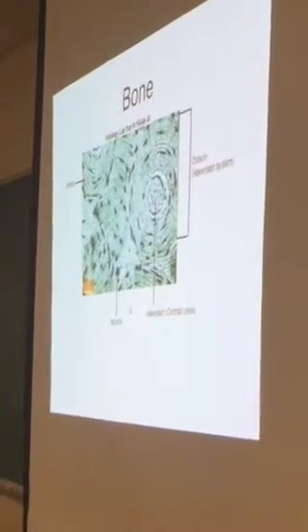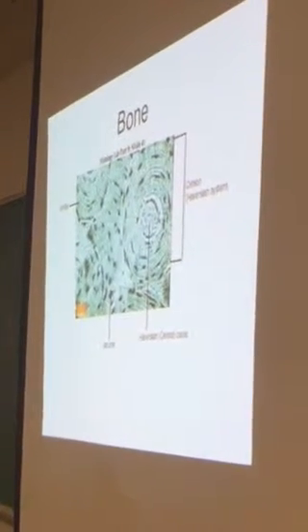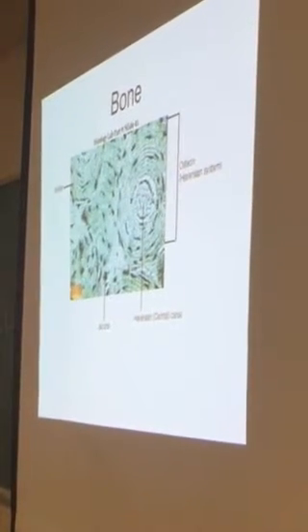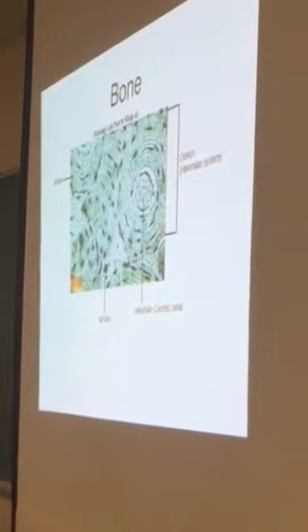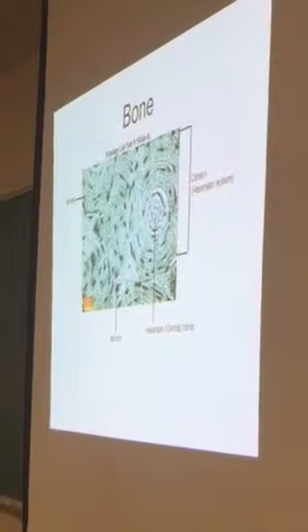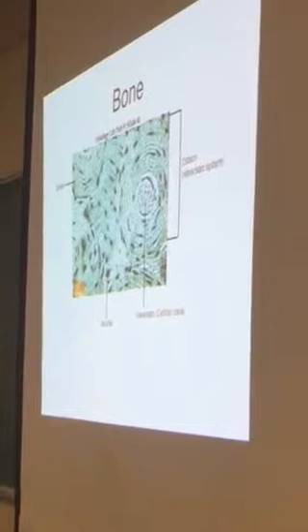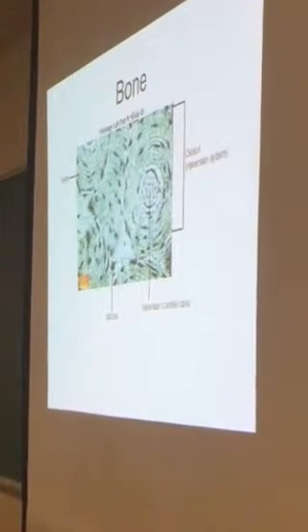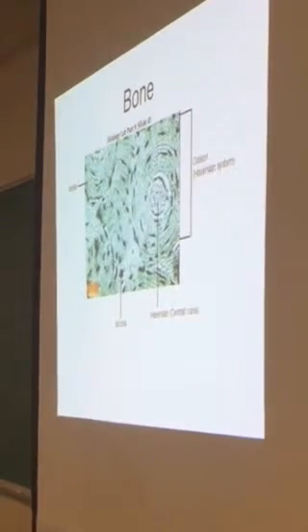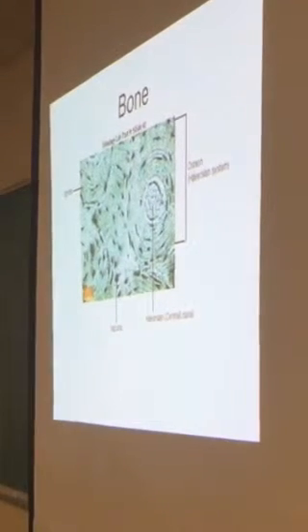Each bone cell is contained within a lacuna. Because of the way they make the stains that they use to make bone slides, the osteocyte is usually burnt out, so all that's left is the lacuna. That's not the same on your bone model. On your bone model, you have spaces. The spaces are your lacuna. You also have these spider-like cells. Those are your osteocytes. All right? So make the distinction between the cell and the model.